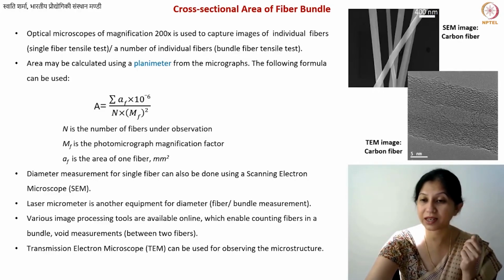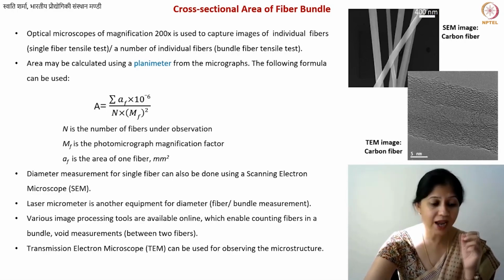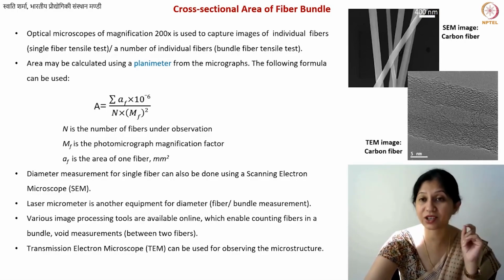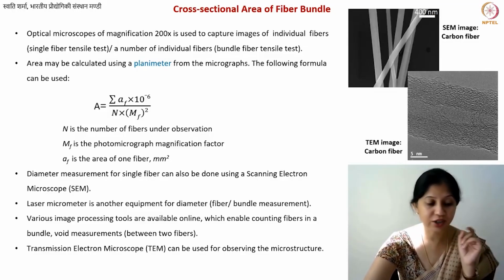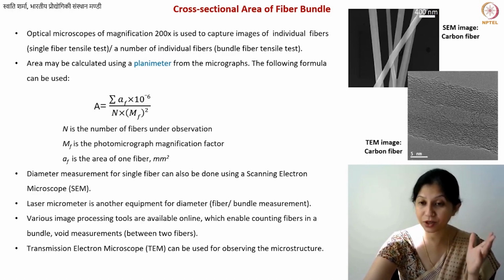But in this particular case, you see that the fiber diameter is approximately 20 nanometer, and you can see how the chains are aligned. Actually, these are the chains that I call turbostratic. You can see these wavy chains. And if you actually measure the distance between these chains, it is higher than what you will get for ABAB type graphite crystals.